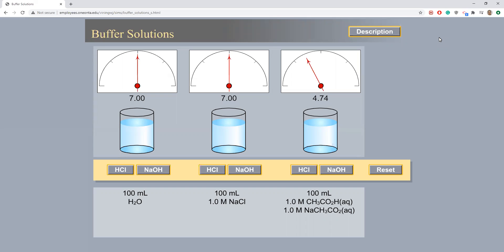In front of you are three beakers containing, from left to right: 100 milliliters of H2O or water; 100 milliliters of 1.0 molar NaCl; and 100 milliliters of a mixture of equal portions of 1 molar CH3CO2H or acetic acid and 1 molar aqueous NaCH3CO2 or sodium acetate. The initial pHs for each of the mixtures are 7, 7, and 4.74.